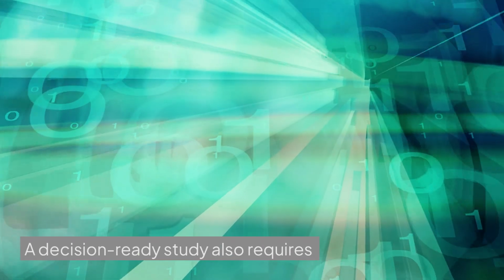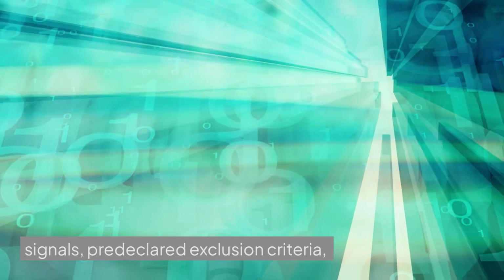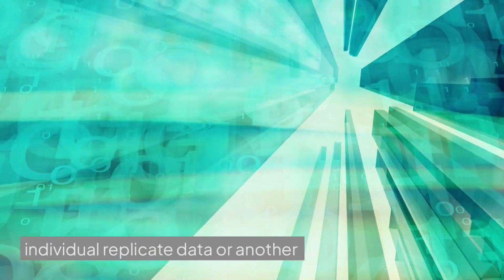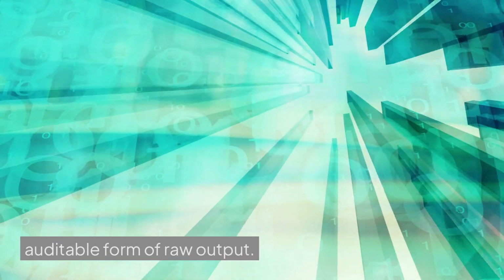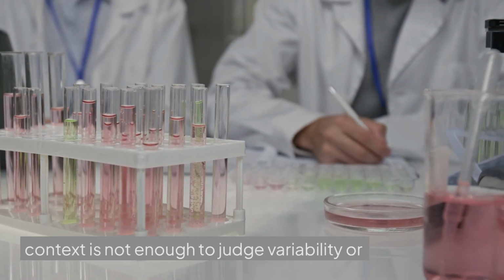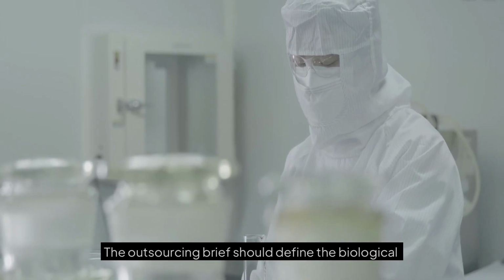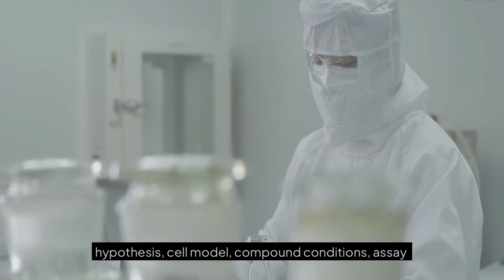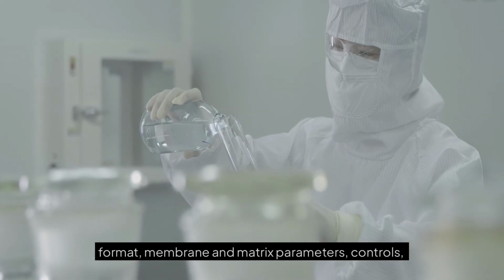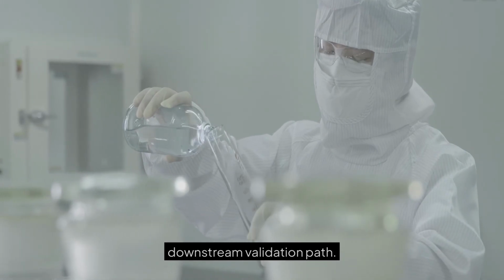A decision-ready study also requires replicate consistency, traceable images or signals, pre-declared exclusion criteria, normalization details, and access to individual replicate data or another auditable form of raw output. 1% without experimental context is not enough to judge variability or justify follow-up work. The outsourcing brief should define the biological hypothesis, cell model, compound conditions, assay format, membrane and matrix parameters, controls, replicate structure, statistical expectations, and downstream validation path.